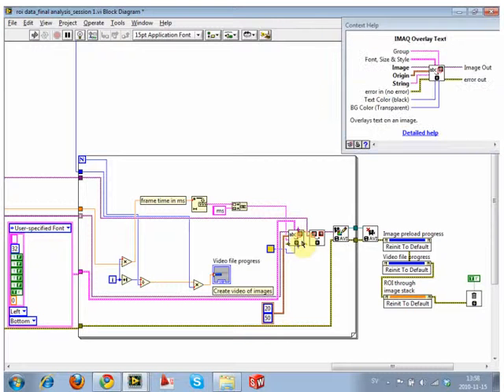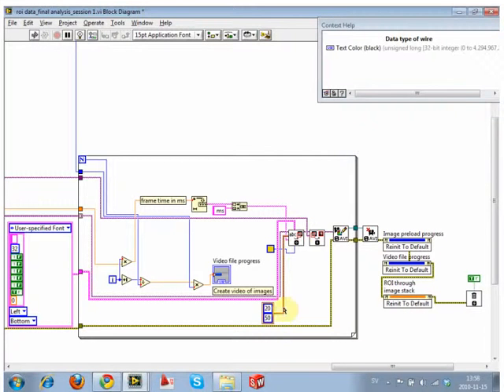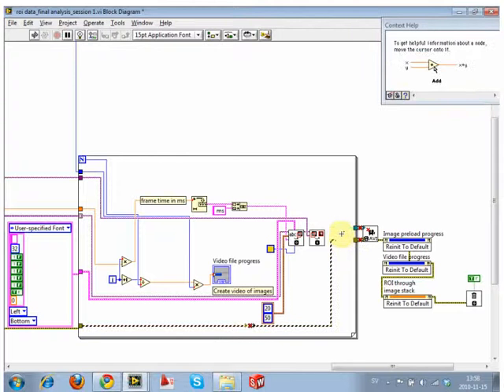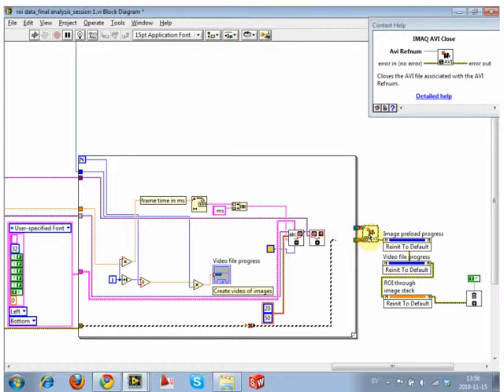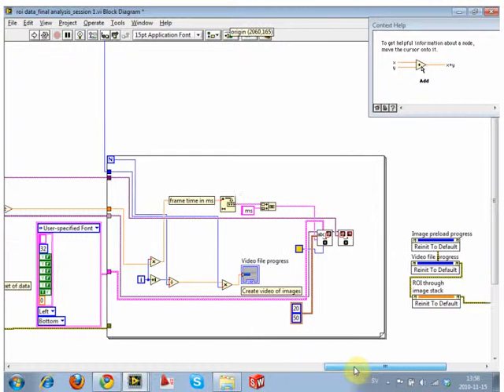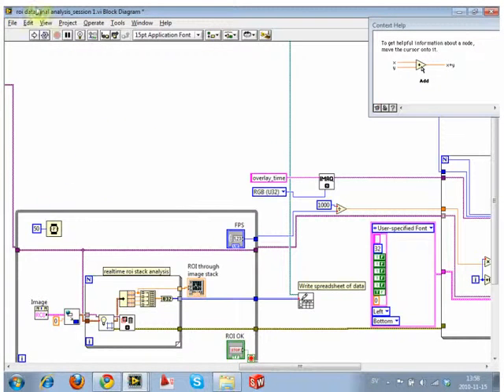Time 58. No, I'm not going to. I'm going to show you how we do it. So I'll delete this video, and then this video. Control B that one. Okay. So you notice now that it says it's going to work fine. And it will. It's just not going to make a video.